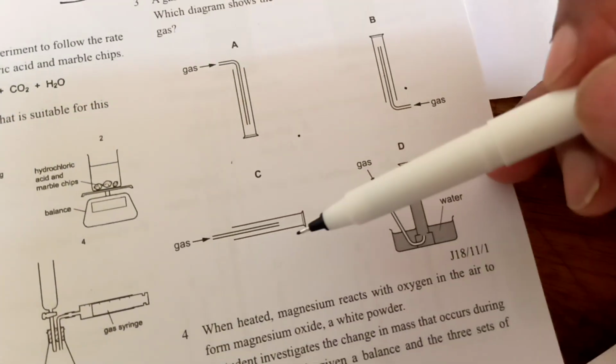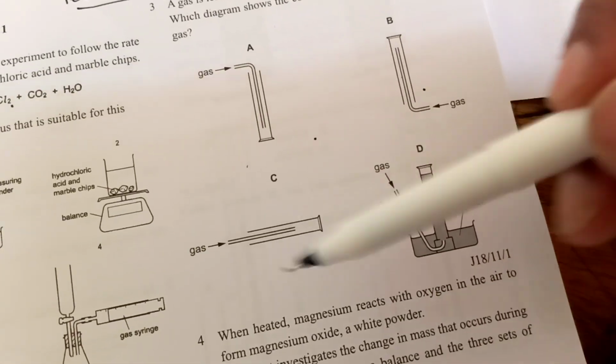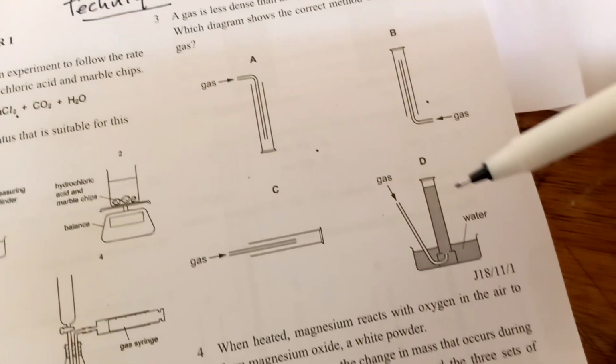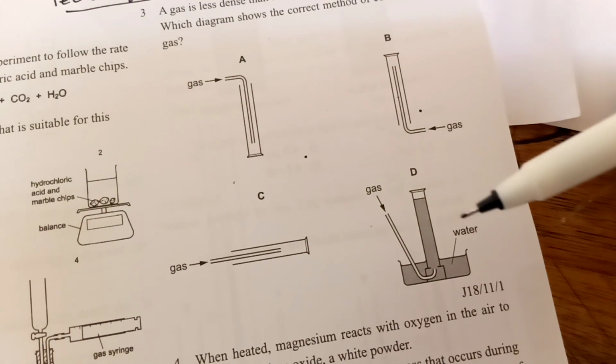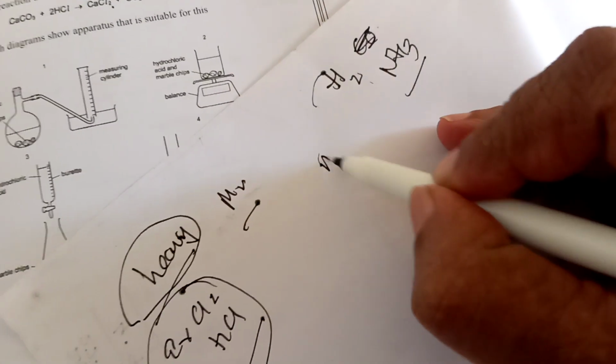Now, this is not correct. This is a wrong apparatus. We cannot use this for collection of any gas. Now, this one we can use to collect gases which are not soluble in water.